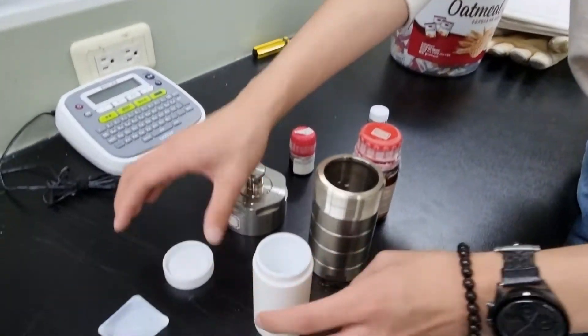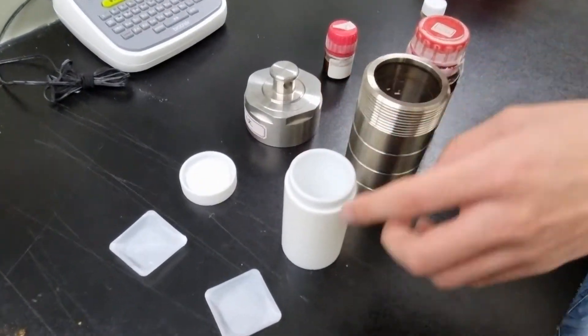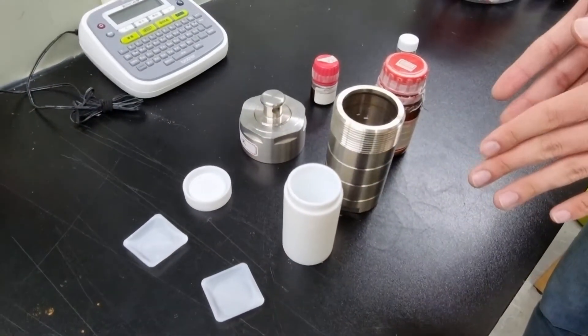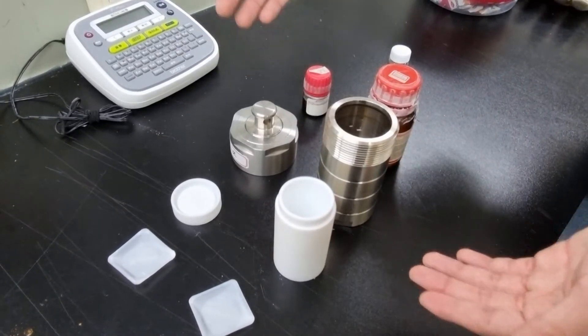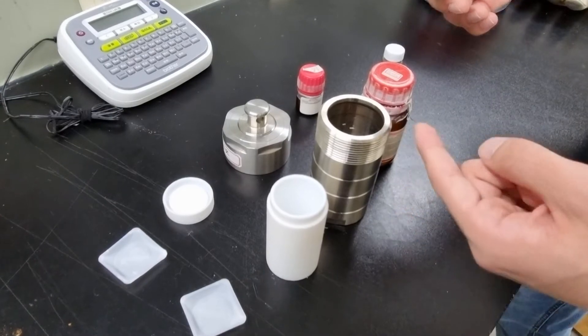Once you put your desired metal salt, ligand, and solutions into the same container, you move on to sonication, which is applying sonic waves in order to mix the solutions inside, making them homogeneous.